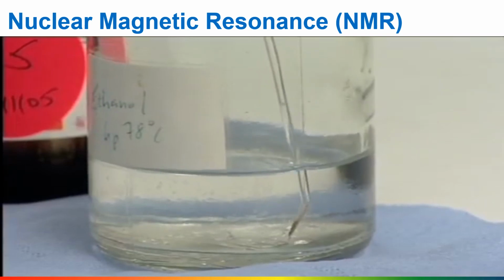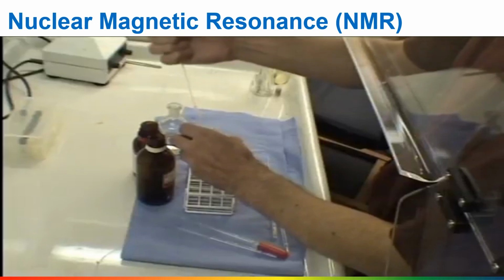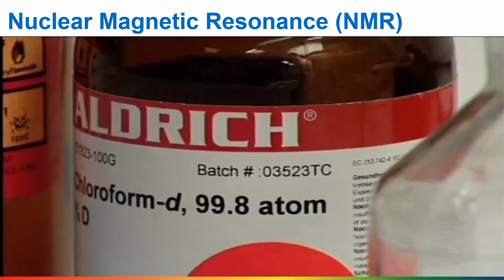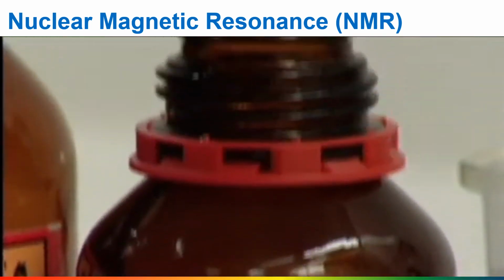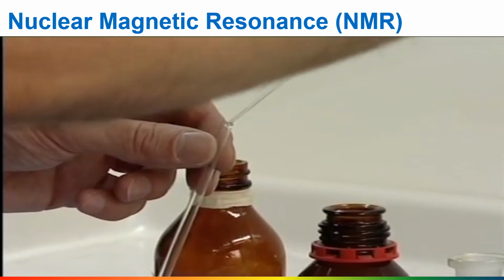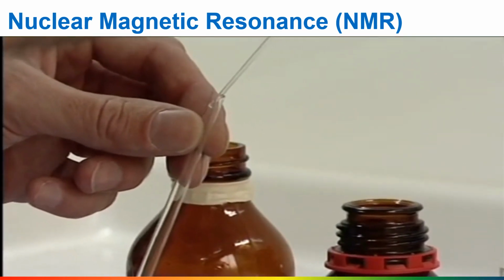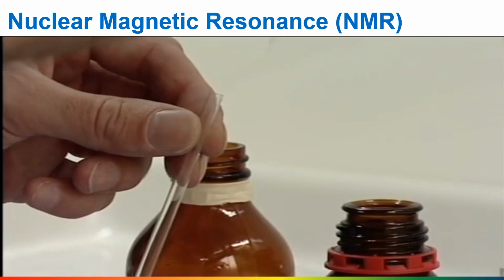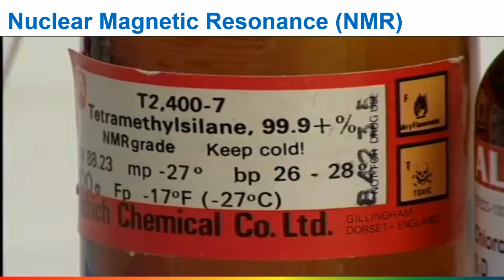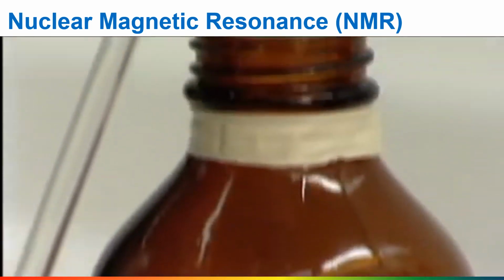Here we will run the proton spectrum of ethanol. A small amount is taken and dissolved in deuterated trichloromethane. This solvent is trichloromethane, in which all the hydrogen atoms have been replaced by deuterium. This is so that the signals from hydrogen atoms in the solvent will not be mixed up with those in the sample. A little tetramethylsilane, TMS, is often added as a reference.